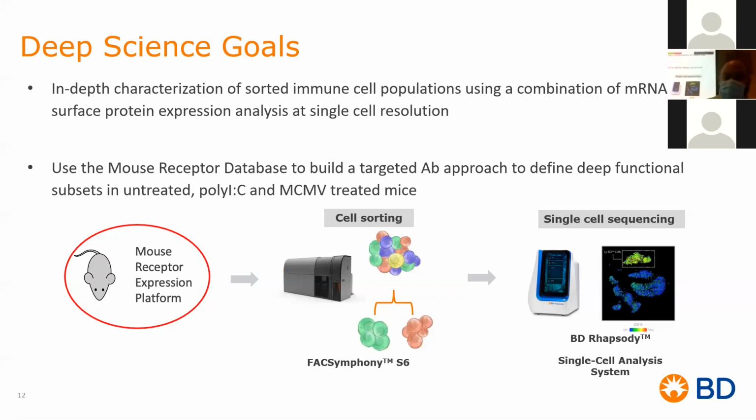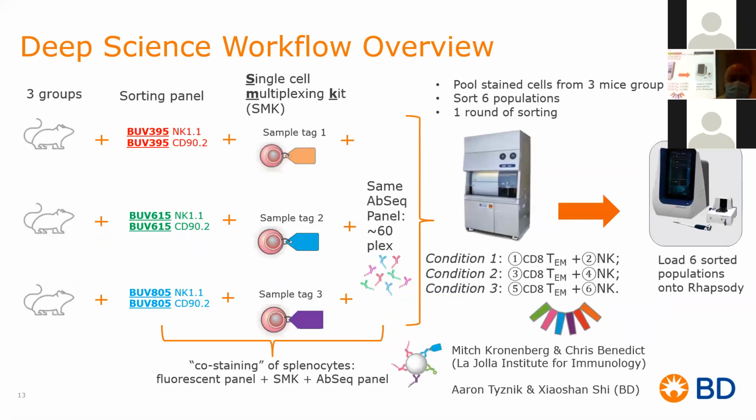So I would highly encourage doing enrichment, unless you're looking at the total differential expression in PBMC. Then for this experiment, after we sorted the cells, we went into single cell sequencing. And for single cell sequencing, we did it with multiomics, right? So we're looking at both RNA and protein. And that's what I'm showing you here.